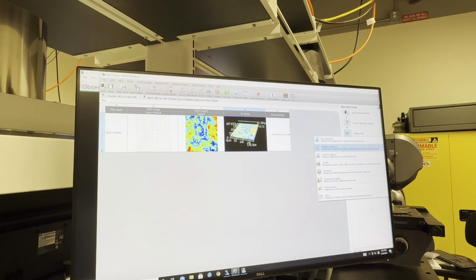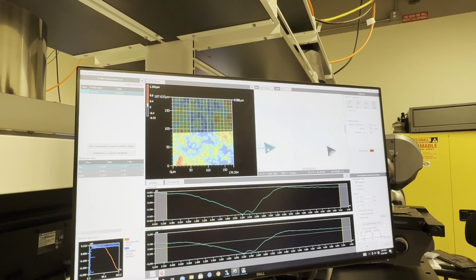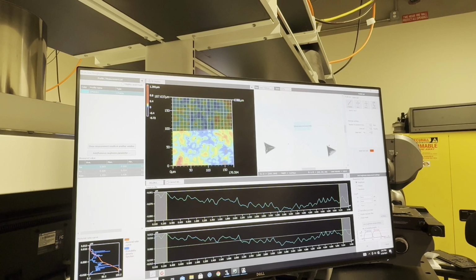Another thing you can do is to use multi-lines, which will give an average of the line roughness. In most cases, you don't want to do this on indents and want to use it more in plane surface areas.